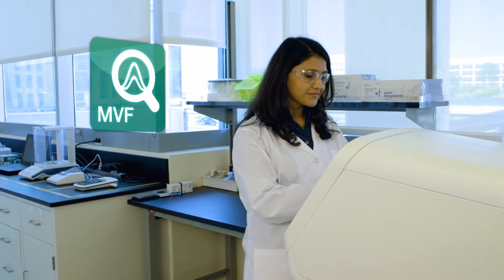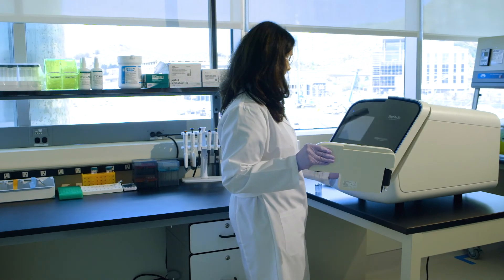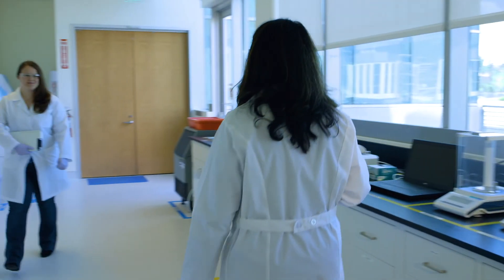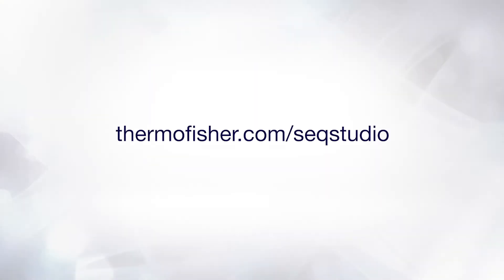Secondary analysis includes Minor Variant Finder software for detection down to five percent. All done — that's all there is to it. To learn more, talk to your local Thermo Fisher Scientific representative or visit us on the web.